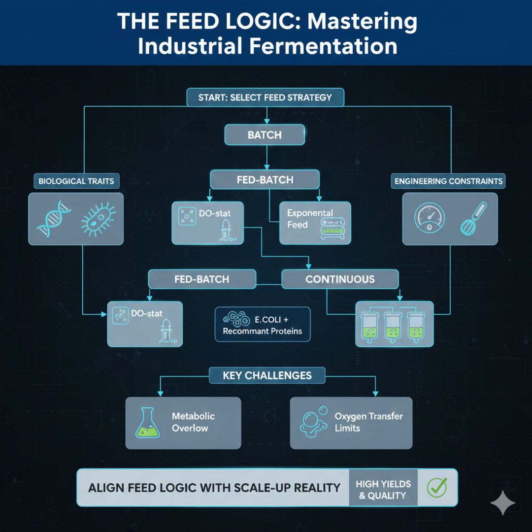Okay, so we know the cell's demands, we know the reactor's limits. Now we hit step 3, choosing the base operation mode. Fed batch has been sort of hinted at as the default, but let's be really intentional about this choice. It needs that intentionality. Let's cover the simple case first. You only choose batch, where you load everything up front, if simplicity and low cost outweigh the need for tight control. So when is that suitable?